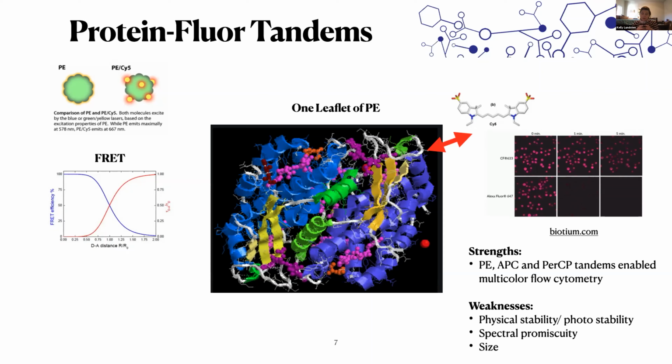that have a greater transitional energy efficiency, so that the energy that's being donated is almost as close to 100% as you can possibly get to being absorbed by those acceptors. That's number one, making sure there's very minimal spill back into the donor channel. And then second, increasing that total stability of the tandem, because the antibody itself already has its own limitations. We don't want the tandem to be so labile that it makes the assay less sensitive, basically.